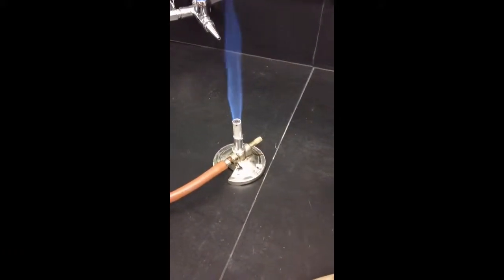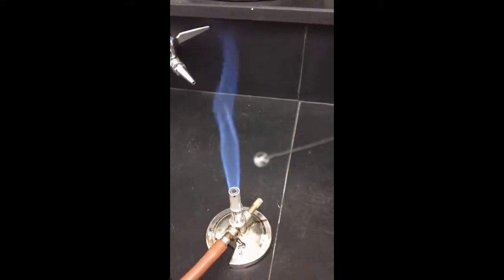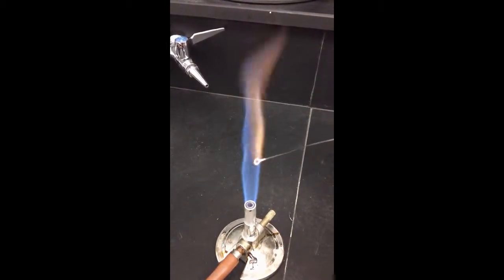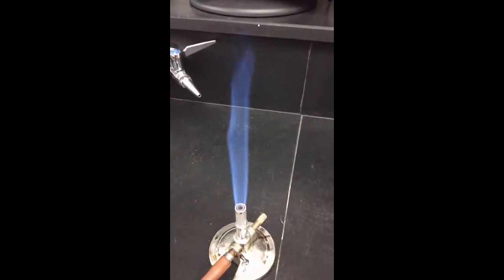I'm making sure that I have a full little bubble there. And pay close attention. Record what you see. I'm going to do it one more time so you can see it.